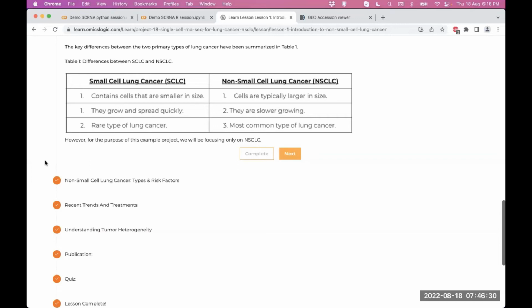Clement, if you are getting a syntax error, then I think you are actually running the install packages in Python's environment. Please start another Colab with colab.to/r. And then after that, if you copy and paste, you will not get a syntax error.